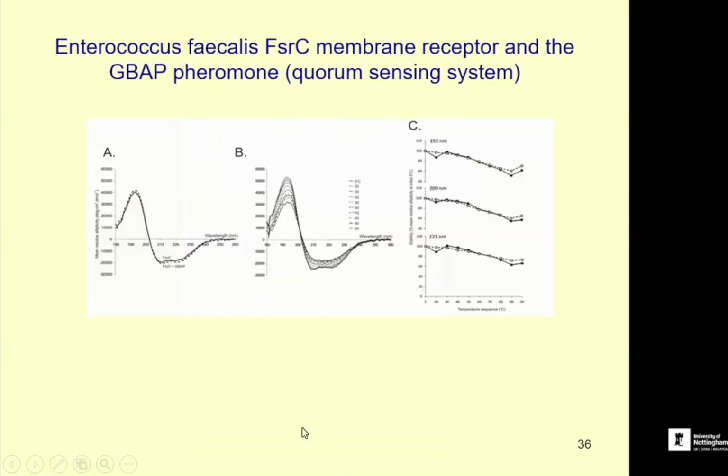And finally, a membrane protein which is involved in quorum sensing in a bacterium and its interactions with a pheromone.